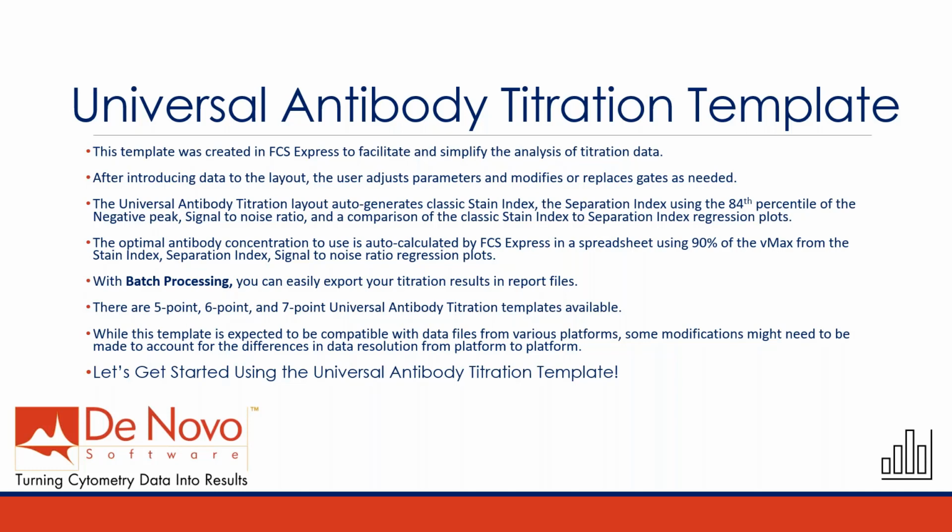With batch processing, once you've done this work to get it set up for the titration data, you get to export those results in your report files quickly and simply by just hitting a button. The software does the rest of the work for you.